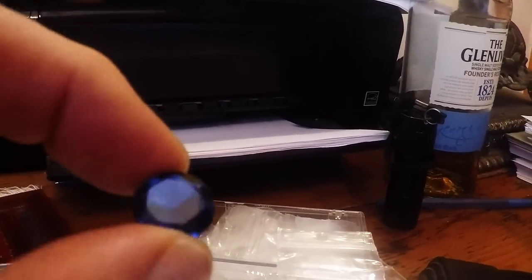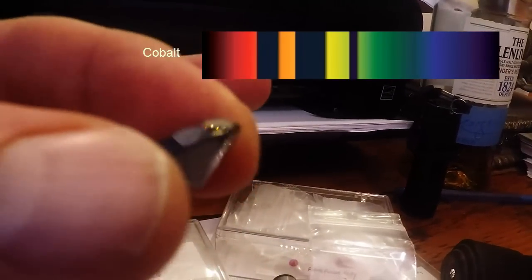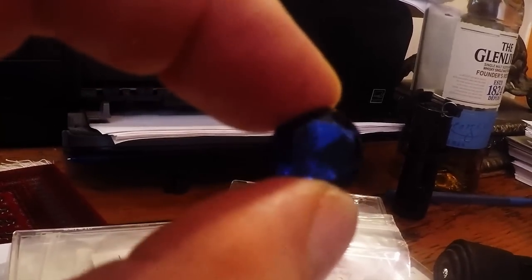You'll also find banding of many, many lines across stones that have been carrying uranium within them. For example, a green zircon will have many, many bands across it. And lastly, this cobalt blue spinel — you'll see the same cobalt spectrum also in cobalt-tinted glass. It's not hard to find that, nor is it hard to find uranium-tinted glass where you can see some interesting spectrums. But again, it's a very unique spectrum for the cobalt-tinted spinel.